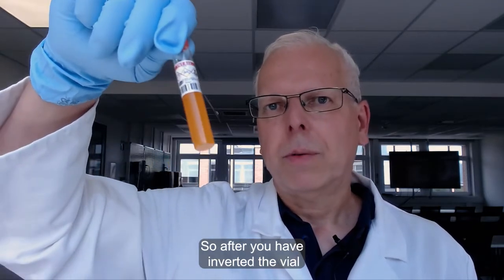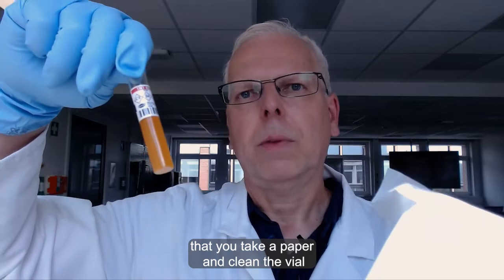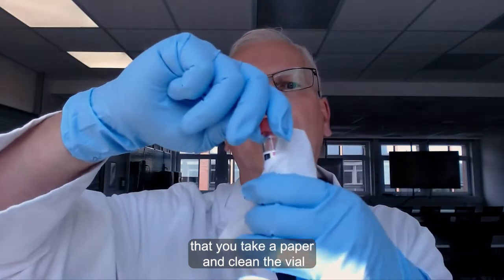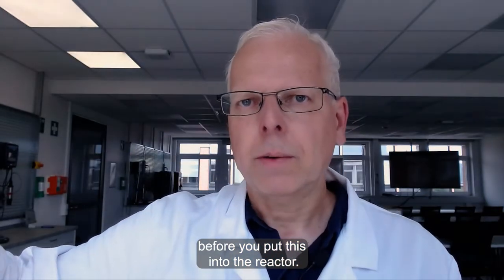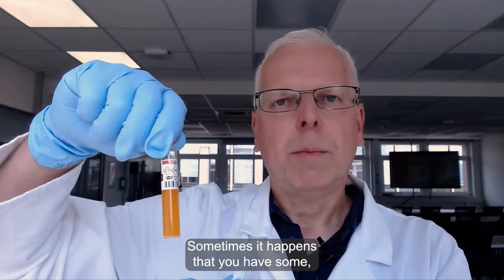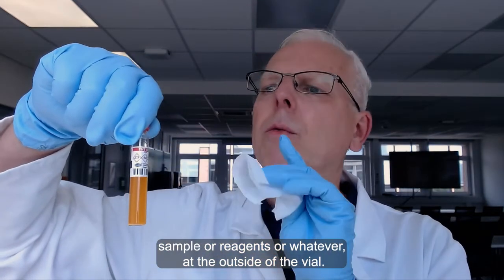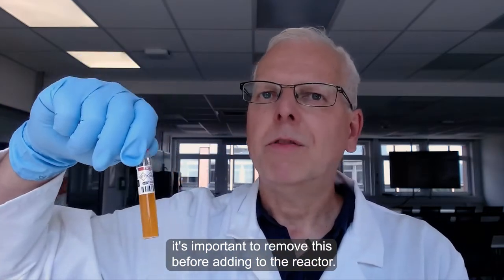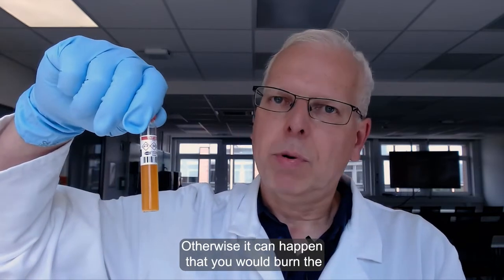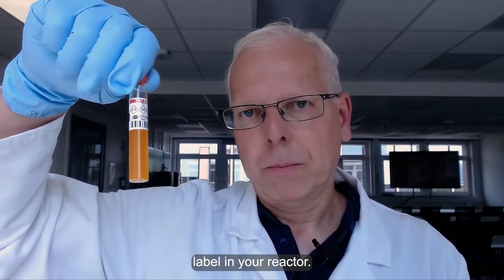After you have inverted the vial, it is important that you take a paper and clean the vial before you put it into the reactor. Sometimes it happens that you have some sample or reagents on the outside of the vial. It is important to remove this before adding it to the reactor, otherwise it can happen that you would burn the label in your reactor.